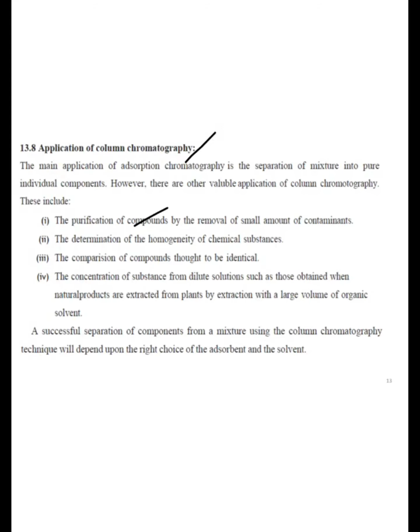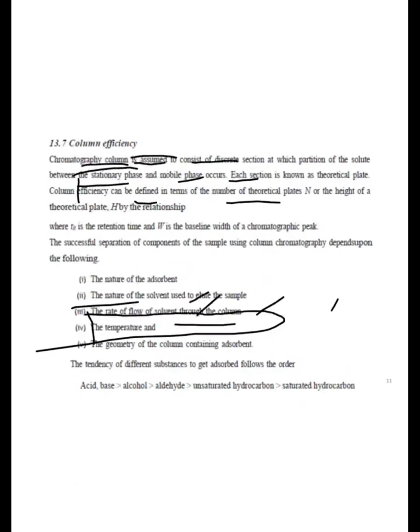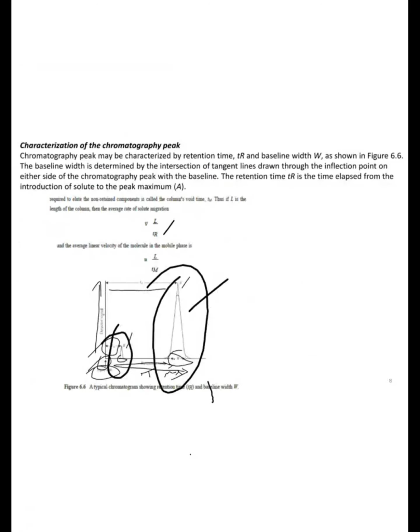And further, the determination of homogeneity of the chemical substance. How are you going to determine the samples by using a chromatogram?